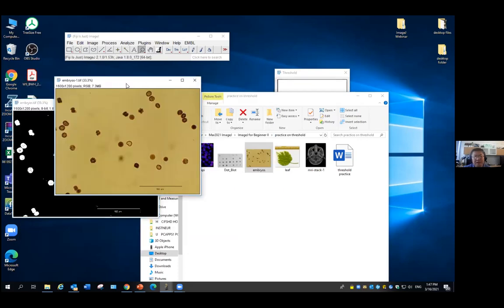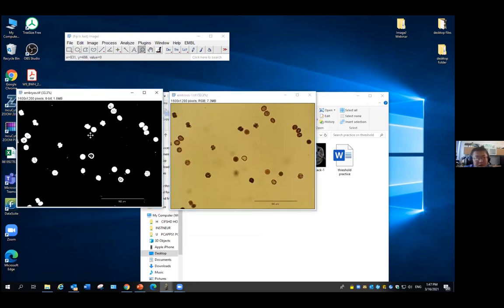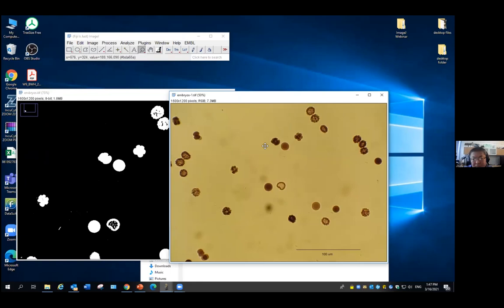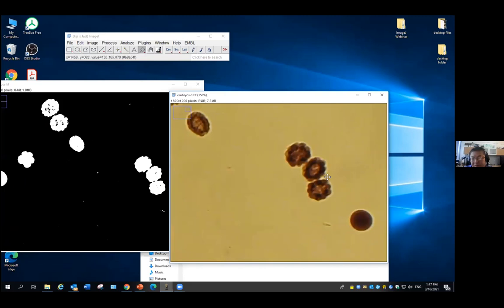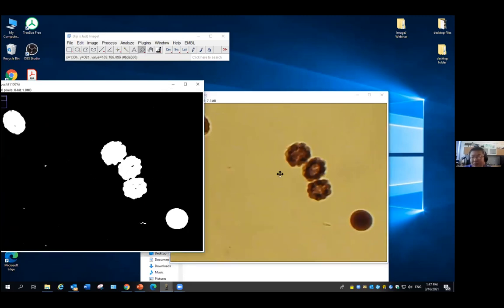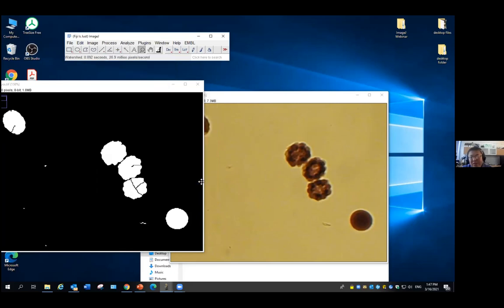This is the original image. Let's look here. Those are the 3 embryos, and this also has 3. I want to identify them. Now let's see if I do the watershed to cut them, going through Process, Binary, Watershed. You will see it also cuts it something like this.